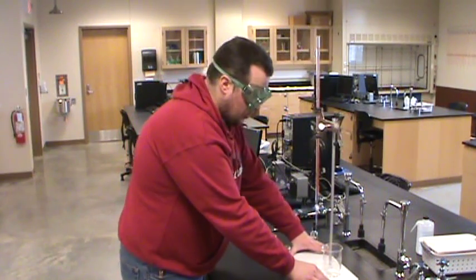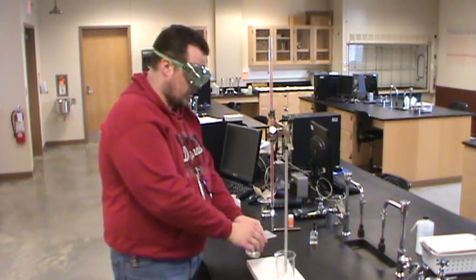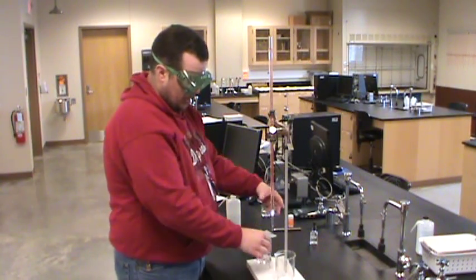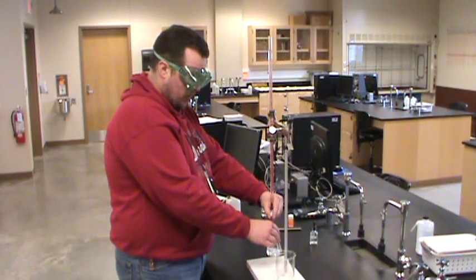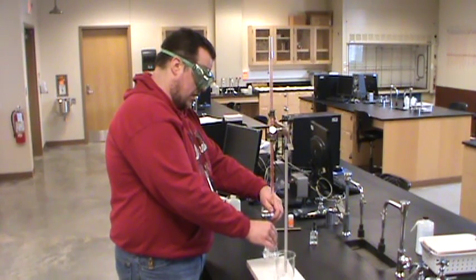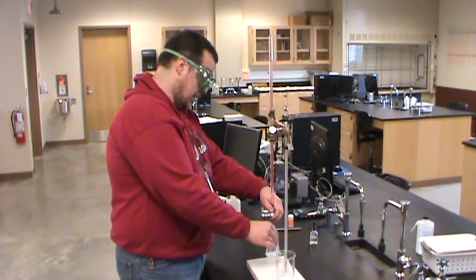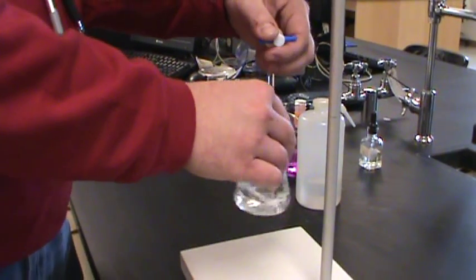All right, now we're ready to titrate. Let me move this a little bit closer to the edge. Remember, Erlenmeyer flasks are made this shape because they're made to swirl. So that's why we tend to use them in titrations. When you're doing a titration, you can control the burette with one hand by reaching across the burette and swirl with the other hand and titrate to a color. So I'm swirling my flask as I start my titration.